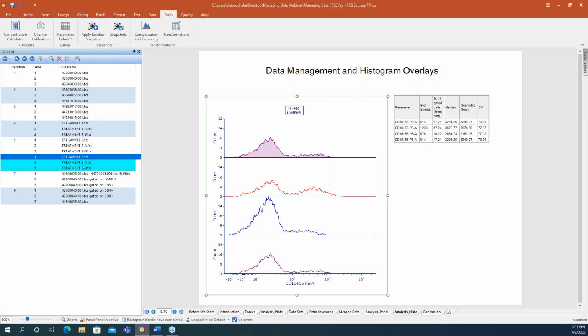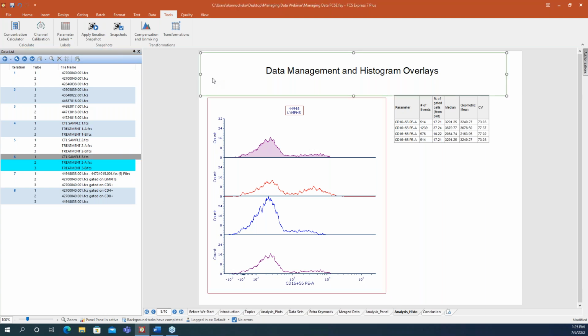All right. And so now another key feature here, after I'm using my data, sometimes I can get a little bit lost, right? I'm using all this data in multiple different places and spaces, and it can become like, okay, what happens if somehow I get disconnected? Meaning these iterations turn gray. I'm no longer able to batch through my data. I'm not sure what happened.